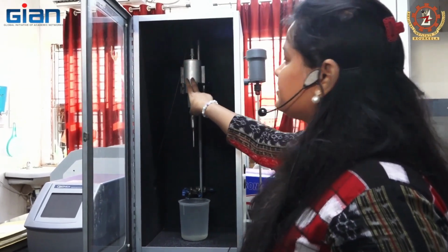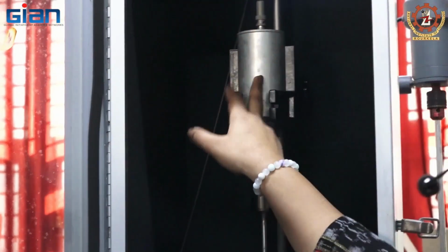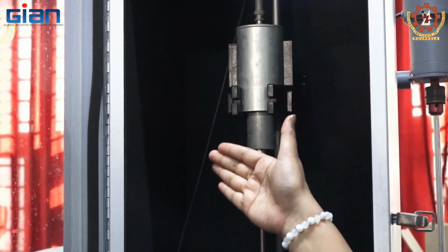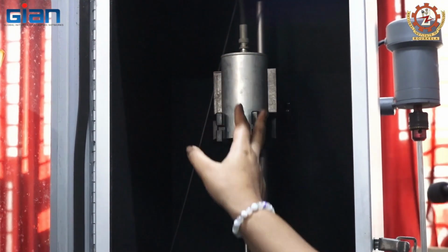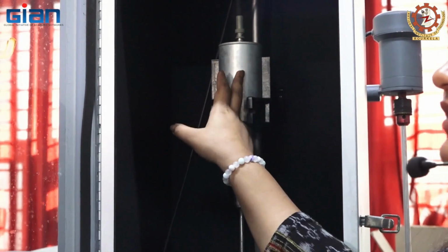Then this is the transducer. The transducer takes the high intensity electric signals and converts these signals into ultrasonic waves, that is, mechanical vibrations.